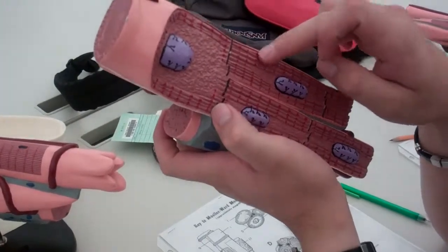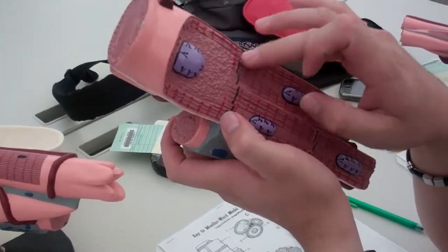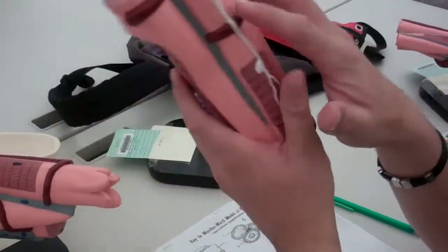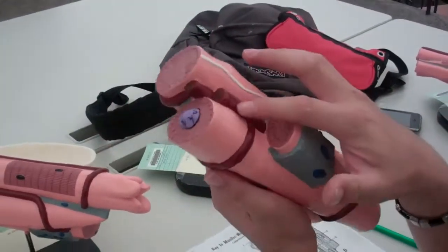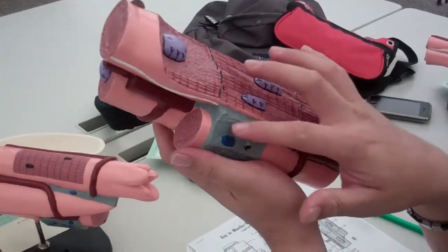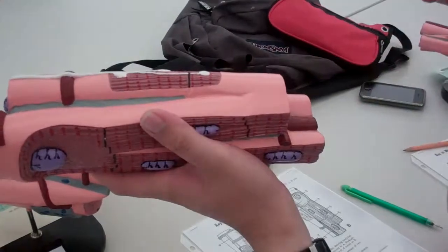So: nucleus, striations, intercalated discs, sarcolemma — just this pink stuff — nerves, blood vessels are these. Did I say endomysium already? Endomysium, and that's it.